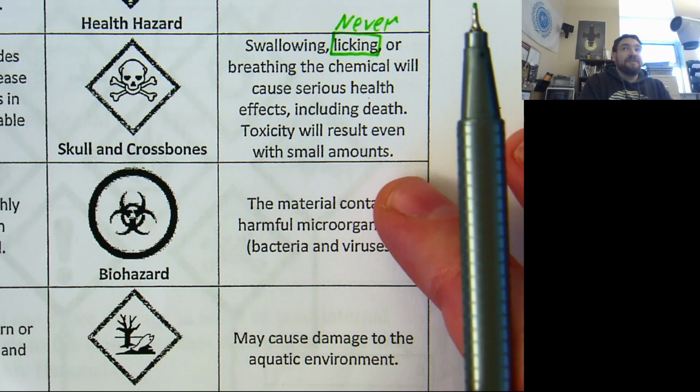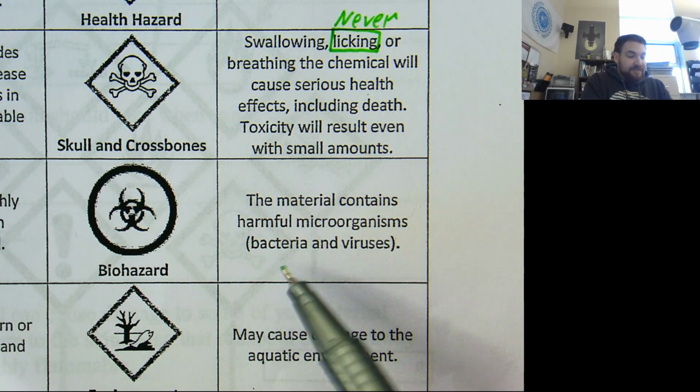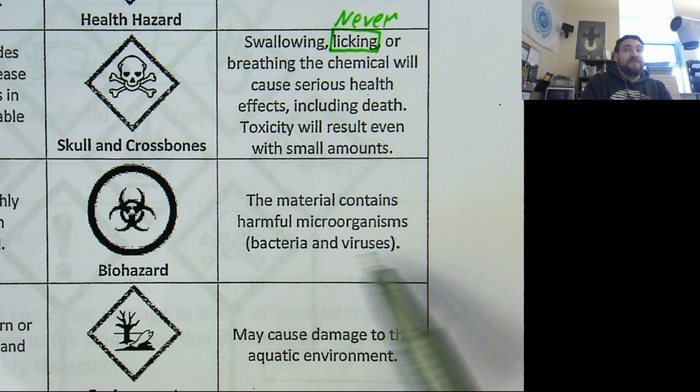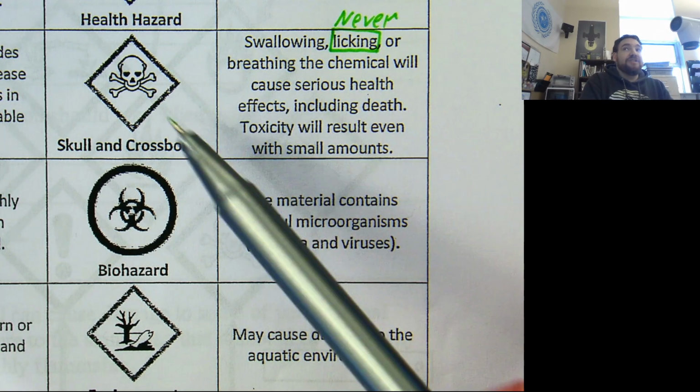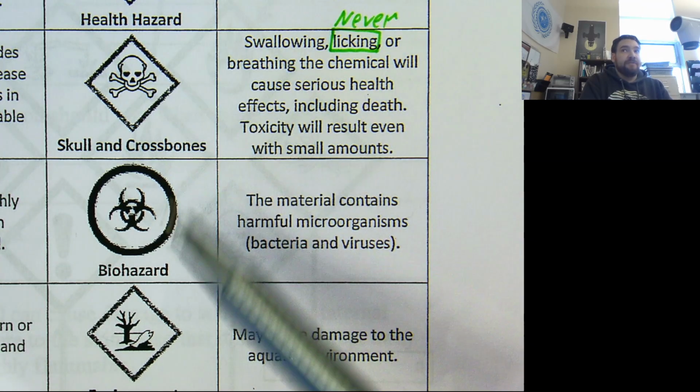The biohazard symbol is a fun one. This material contains harmful microorganisms, so this one's connected to bacteria and viruses specifically. Likely these two will show up together, or often they will show up together.